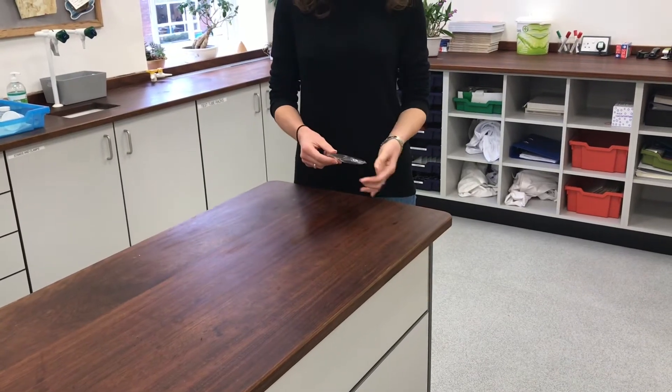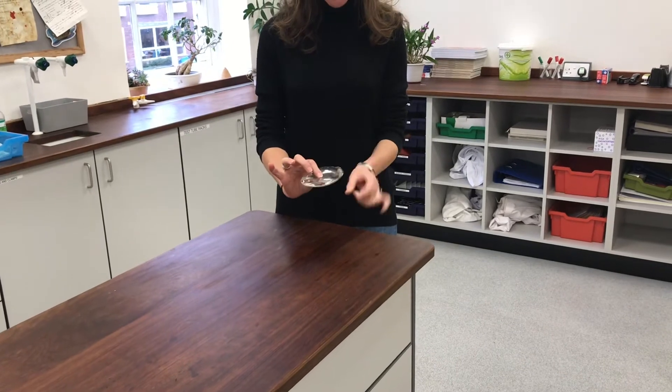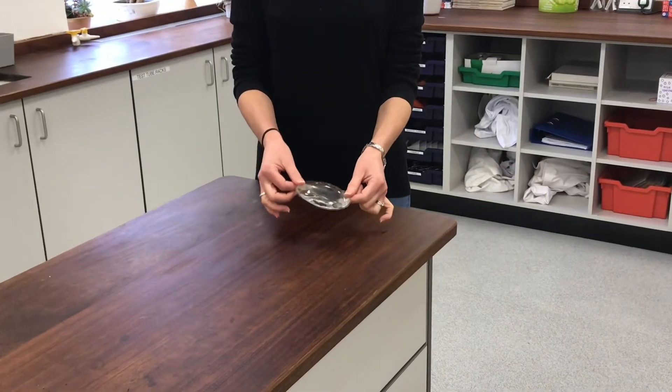This is the experiment for Cold Hands Warm Heart. You might recognise one of these little sachets as being a hand warmer pouch. It's got a little metal disc in it that I can click, and I'll use that in a moment to activate it.